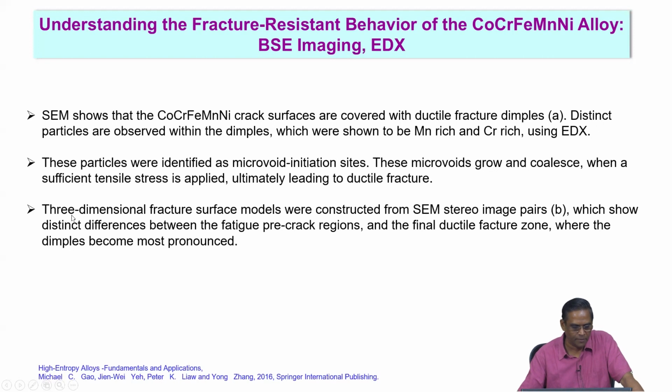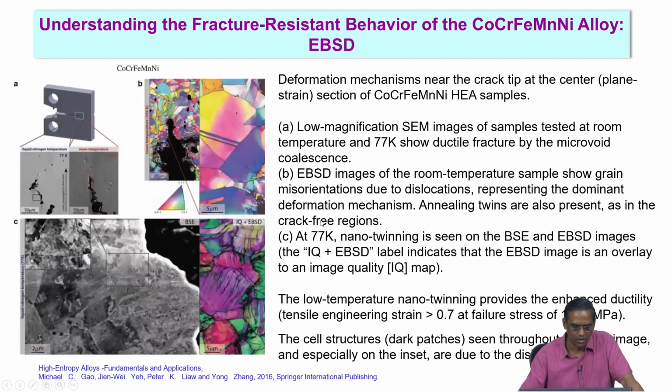And three-dimensional fracture surface models were constructed from SEM stereo image pairs, which show the distinct difference between fatigue pre-crack regions and the final ductile fracture zone, where the dimples become most pronounced. I will explain all these three points one by one. So look at this interesting image.